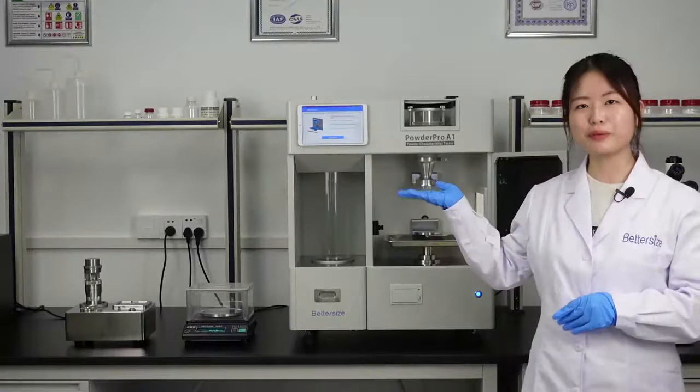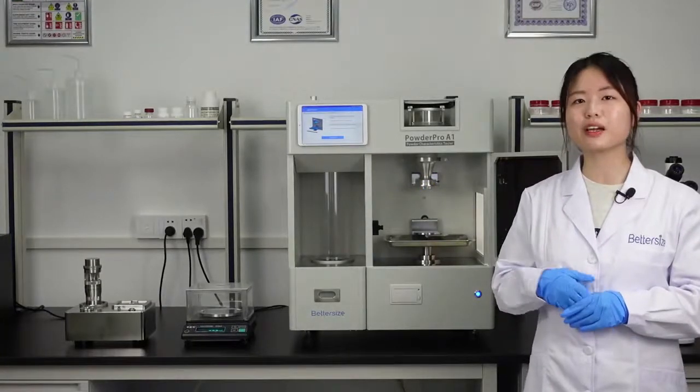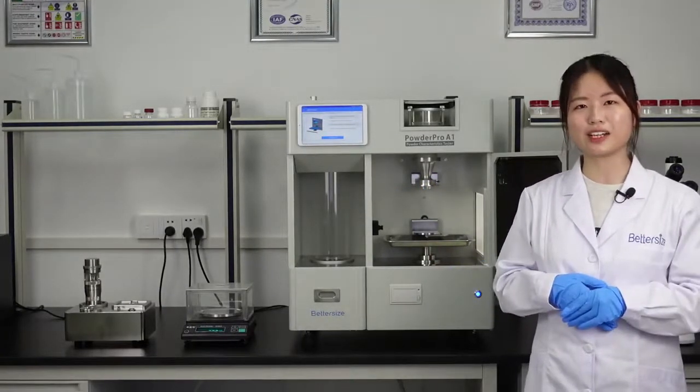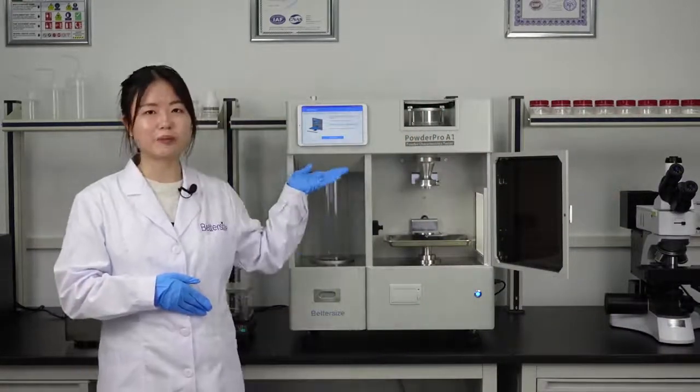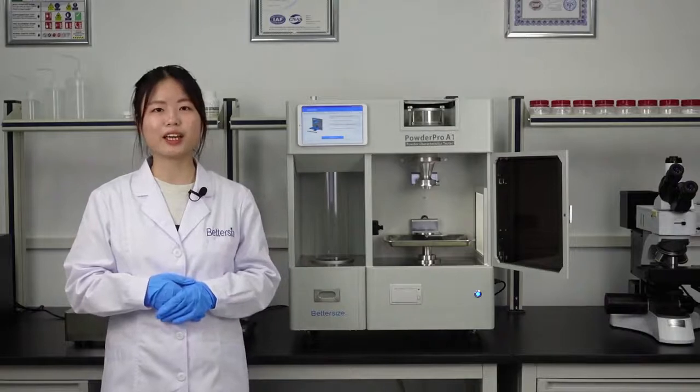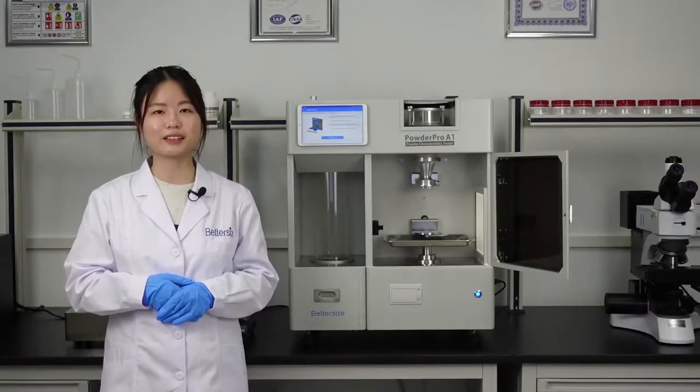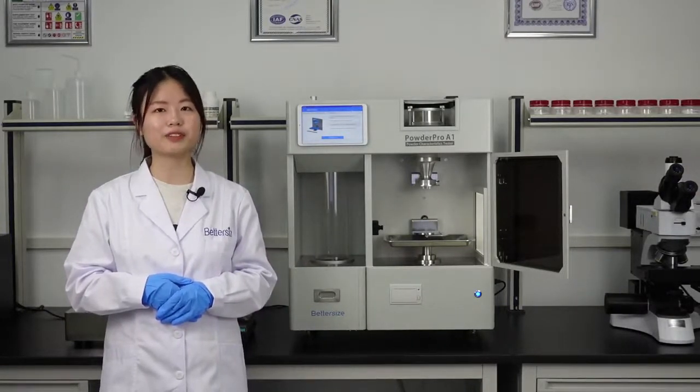The PowderPro A1 has the ability to measure the angle of repose and angle of fall easily and accurately. Also, the Powder Tester app can automatically calculate the angle of difference based on the collected angle of repose and angle of fall data. This intelligent instrument saves your time and helps you analyze the properties of powder materials.